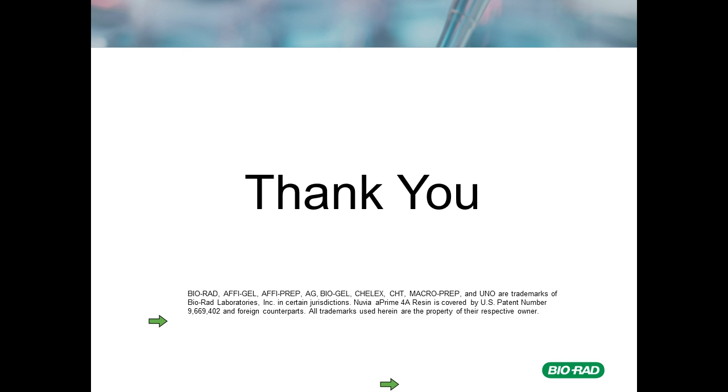SEC doesn't scale well at all, primarily because the flow rate is really low on SEC columns, so processing times are long, and depending upon the resin, you typically can only load a few percent of the column volume to get good separation. Maybe if you're separating really, really big from really, really small, you can load 30%, but that's still a pretty low loading volume compared to other resins.